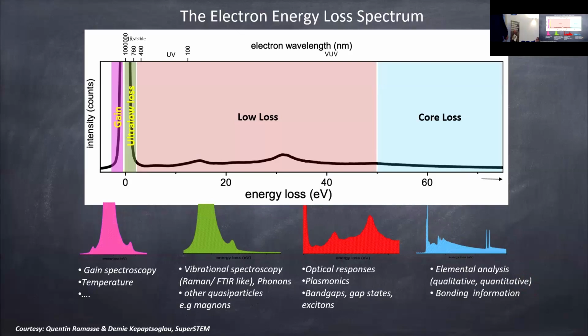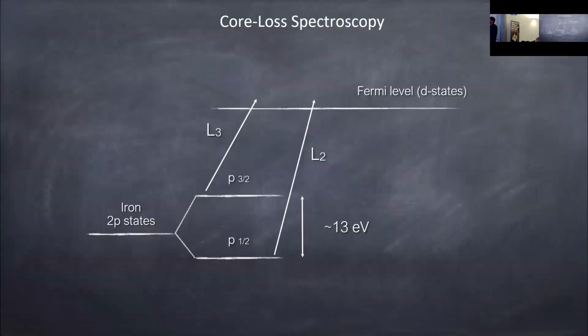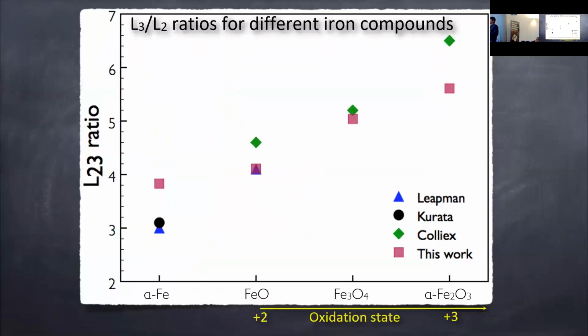But this decay has a power law. When you take the second derivative, that power law cancels out, and then the ratios of the intensities can be taken as the intensity of the peaks on the ratios of the second derivative. And by doing that, boom, boom, boom, here, you can measure the oxidation state.